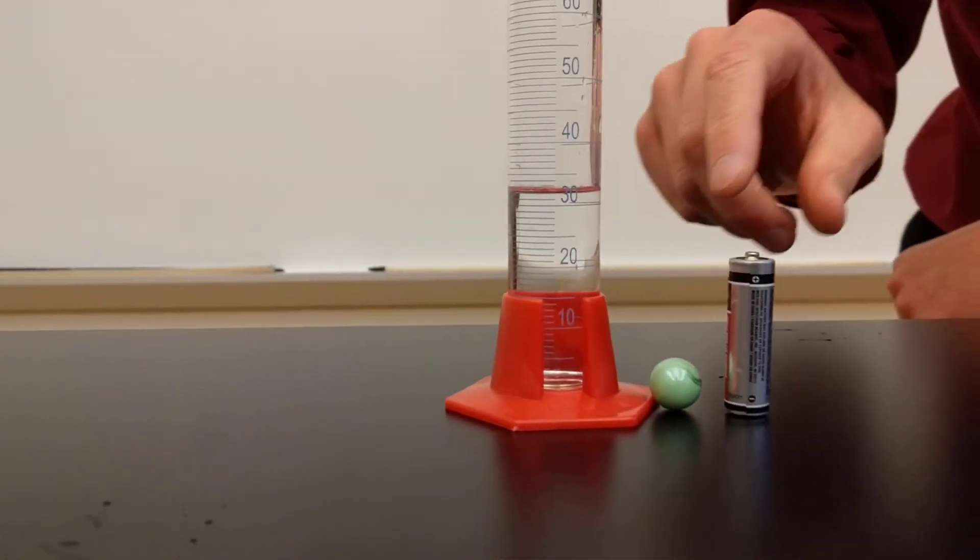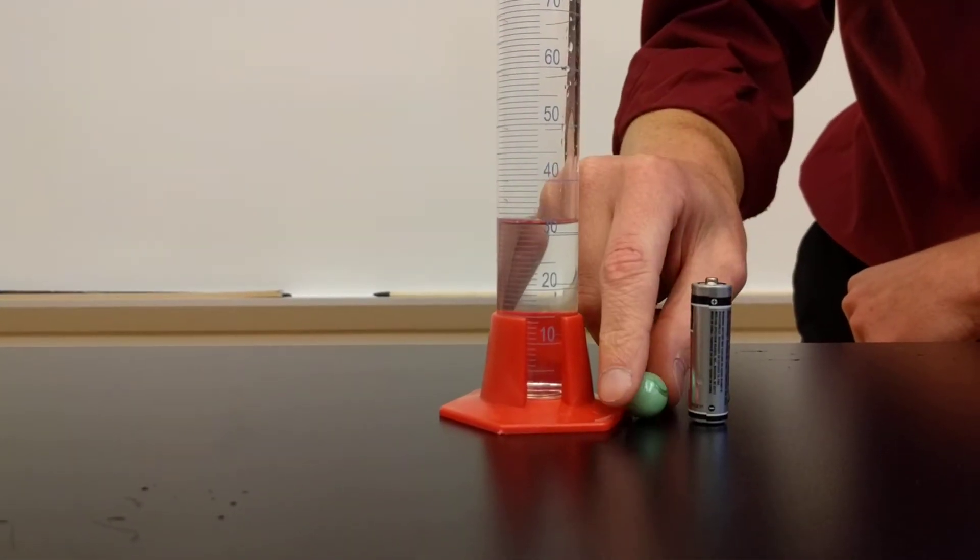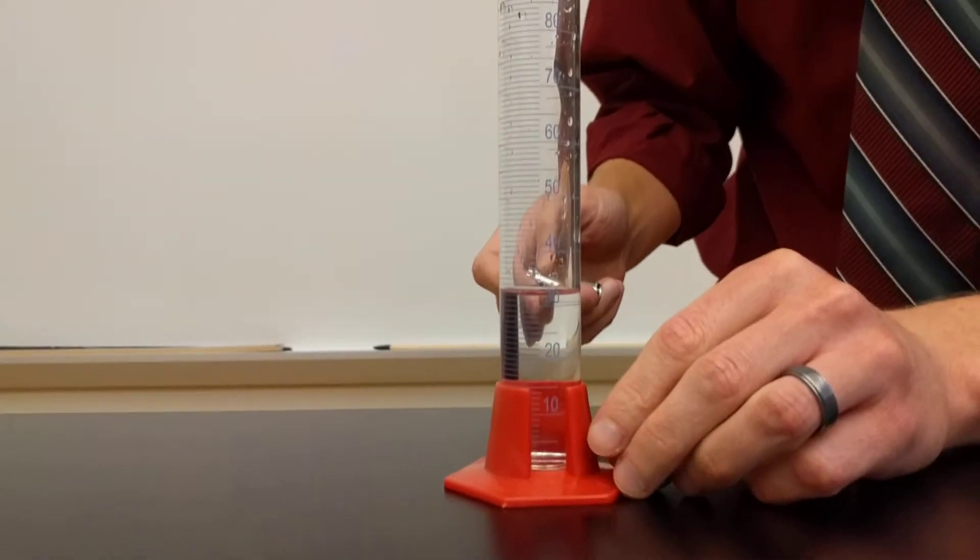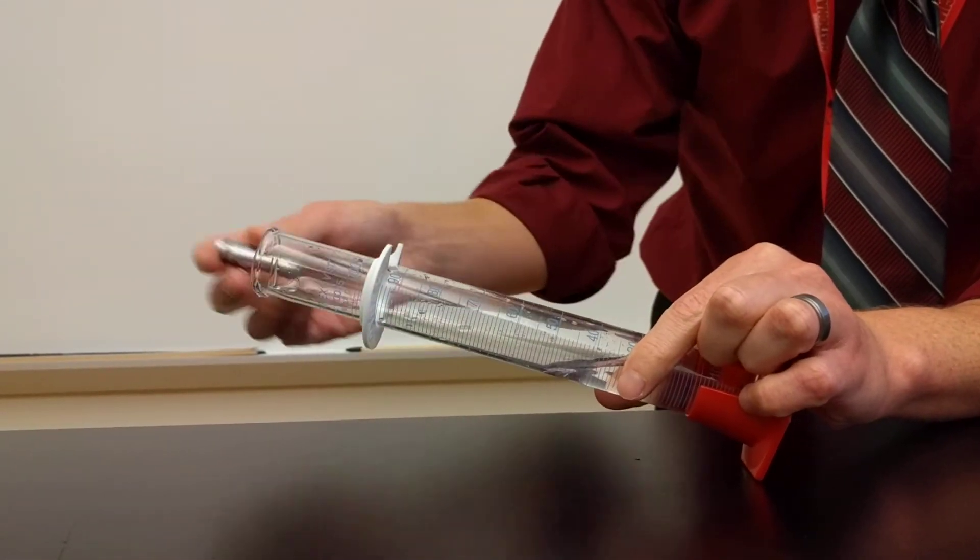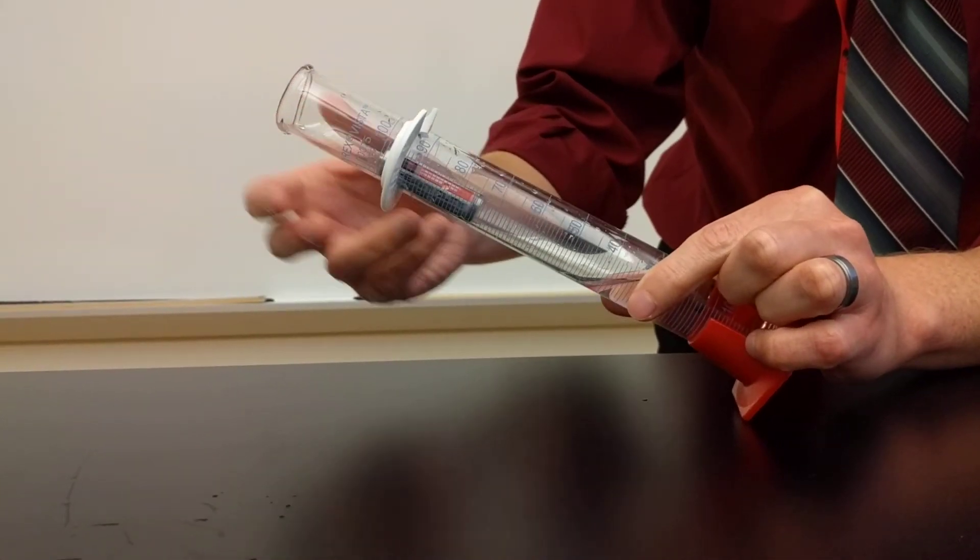Now what we're going to do is we're going to take both objects and place them into our graduated cylinder. And to do that, we're actually going to tilt the graduated cylinder. That way water doesn't splash out, and we don't break our graduated cylinder.